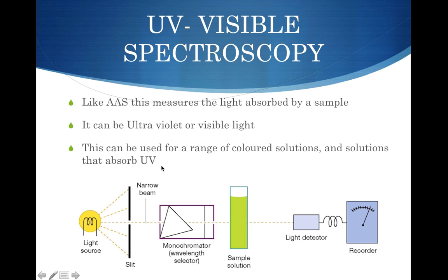Unit 2 Chemistry, Chapter 18, Part 3. Our final way of analysing salts in water is by UV visible spectroscopy. It's similar to AAS, both in terms of principles and in terms of analysis.